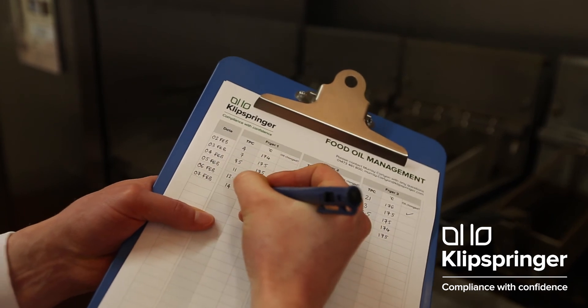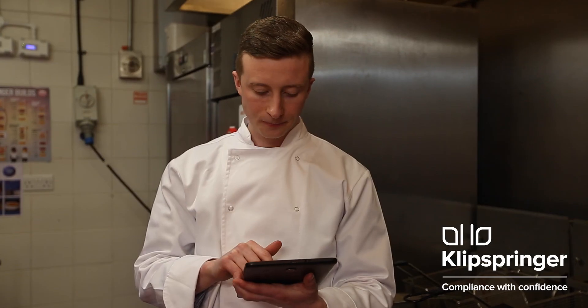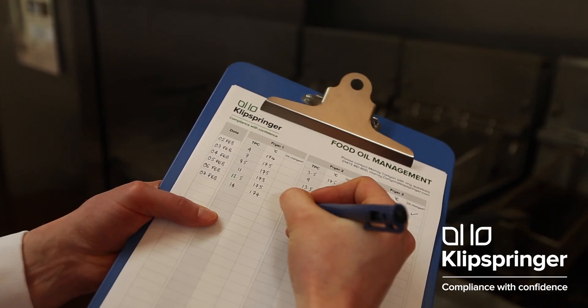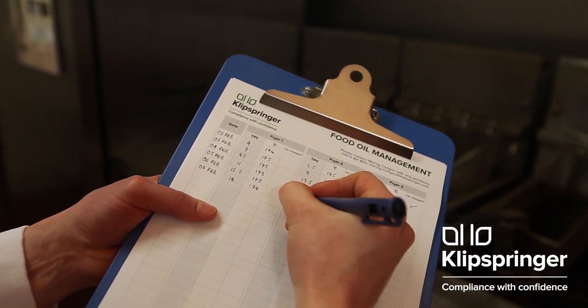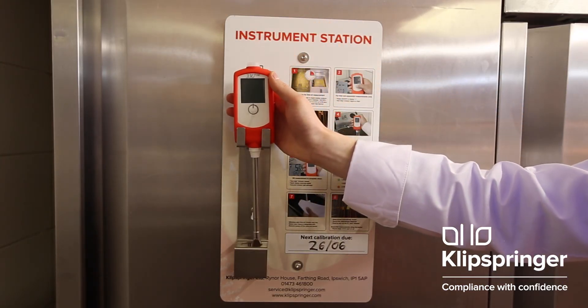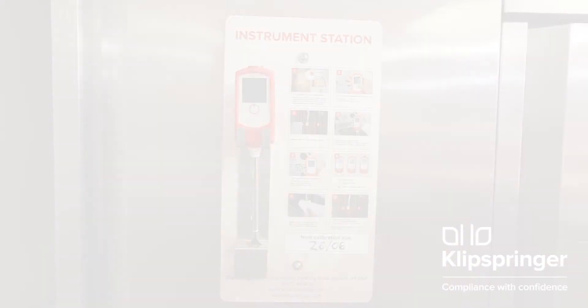Record the results on your designated system. This may be on your tablet or hard copy using pen and paper. Repeat this process for each fryer that needs measuring. Once done, carefully pat the sensor dry and return it to the instrument station ready for next time.